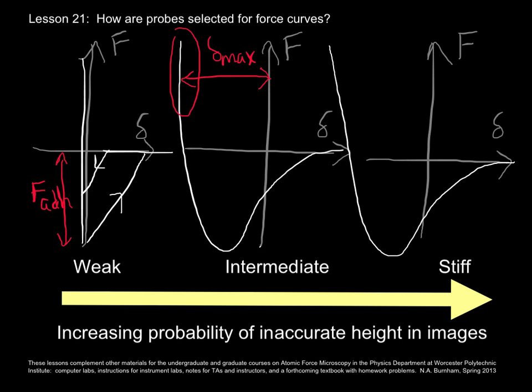There are groups of researchers around the world figuring out clever ways to get around this, using high-frequency excitation of the sample to look at the material's properties using a weak cantilever and exciting that cantilever at frequencies higher than its resonant frequency. Then all sorts of interesting things start to happen.